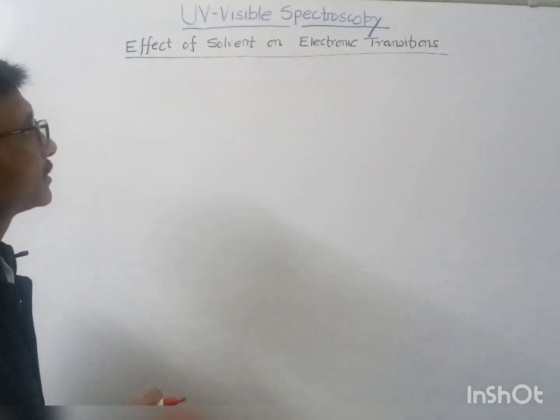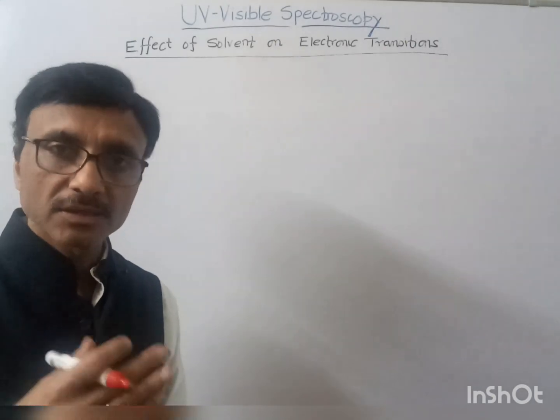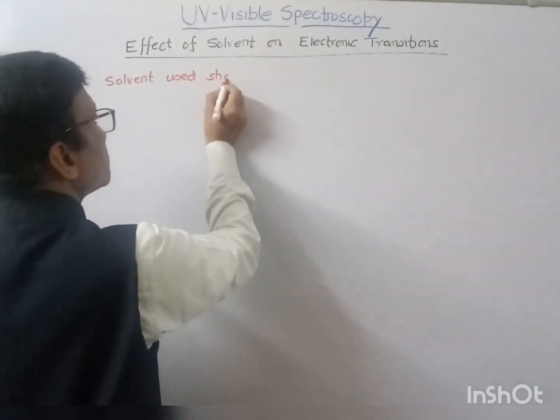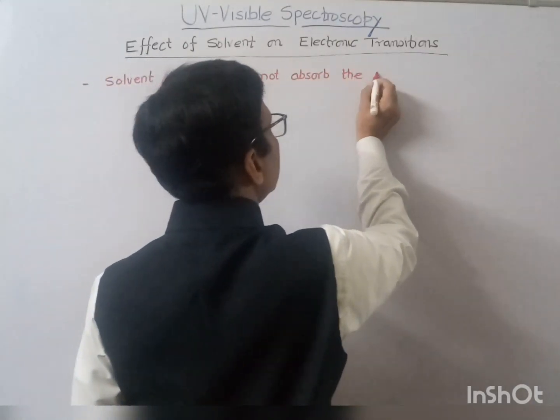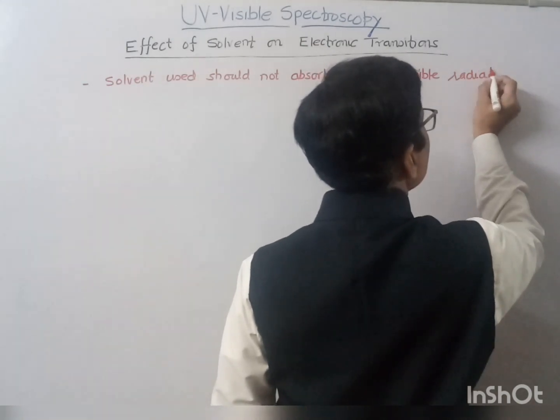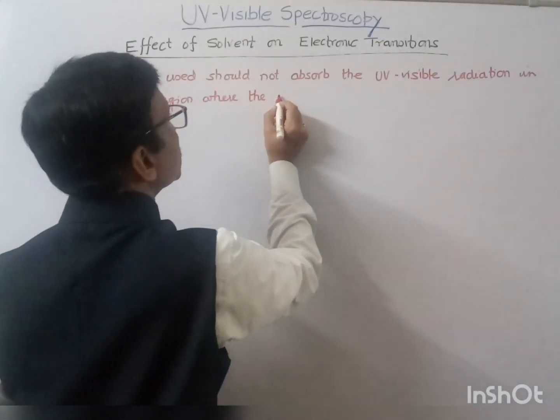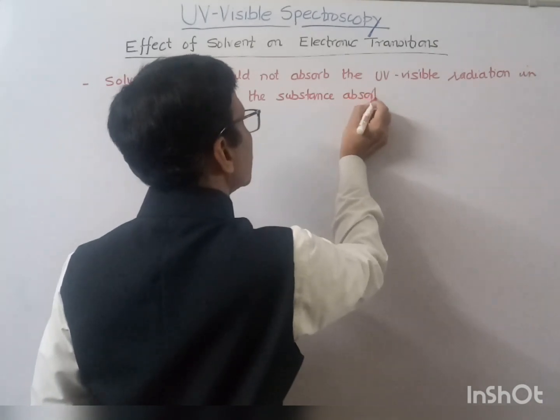Now, one of the things is that the solvent used should not absorb the UV visible radiation in the same region in which the substance absorbs. Okay, this is one of the things.